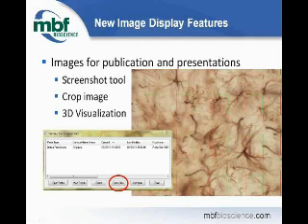If you have your tissue in your probe run, and you select draw sites, it will now overlay the counting frame or Spaceballs probe, whichever your probe is, across the tissue. Then using the screenshot tool, you will get an image of what's in the display window.